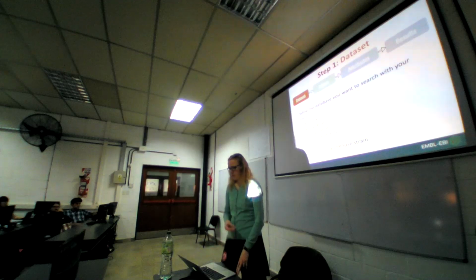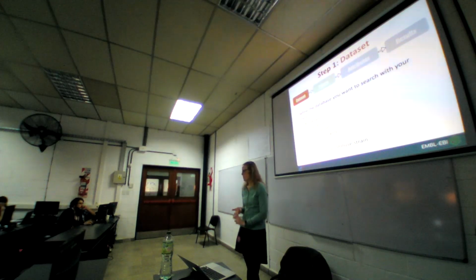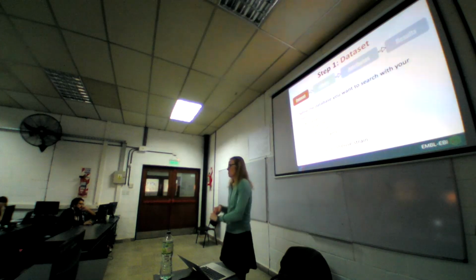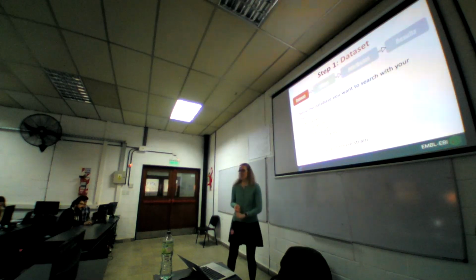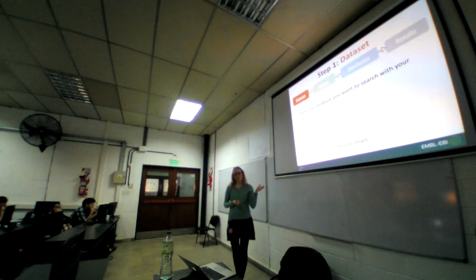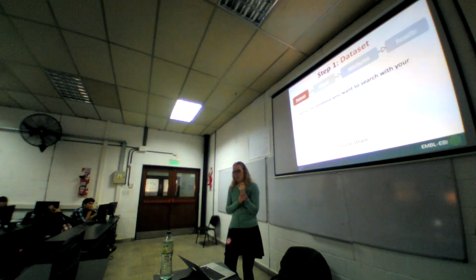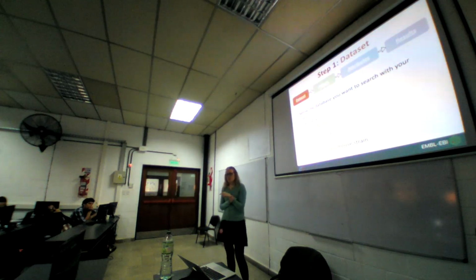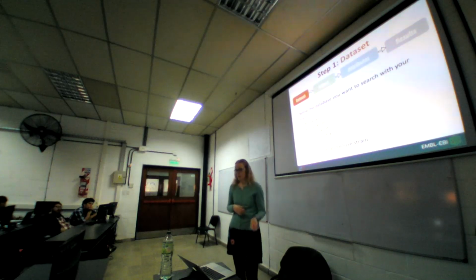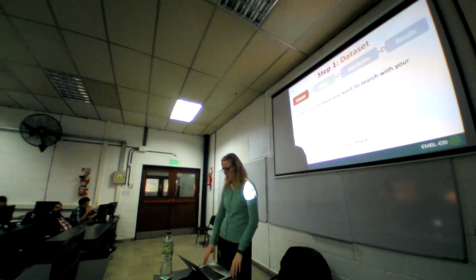To go through this in a bit more detail, in the data set you need to define your species, and then your database. We have databases for genes, for variation and for regulation. It's very important that you choose the correct one. If you choose the wrong one to start with, you will get stuck later. There's a specific case for mice. If you work with a mouse, you need to select mouse as your species and then your mouse strain as the database, because we have 16 of these.